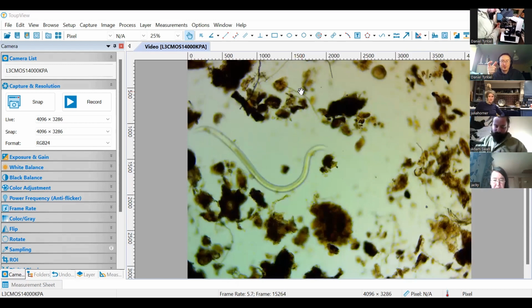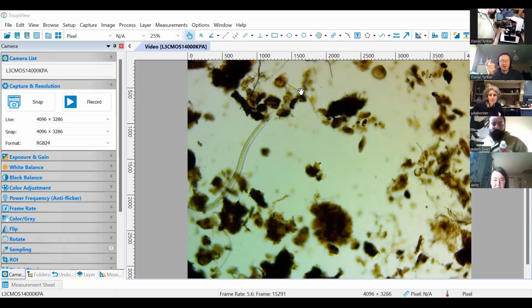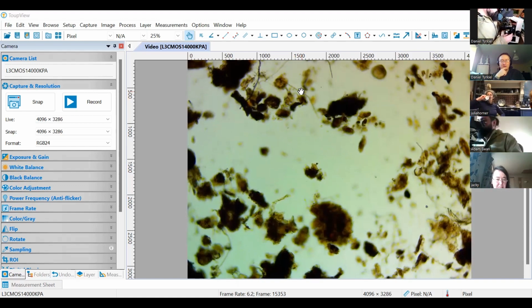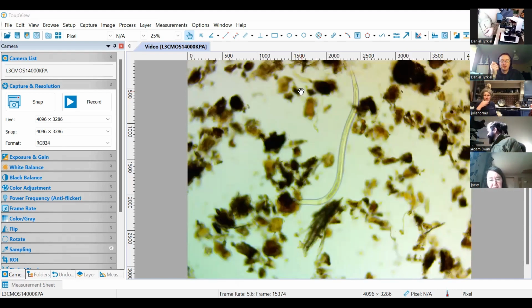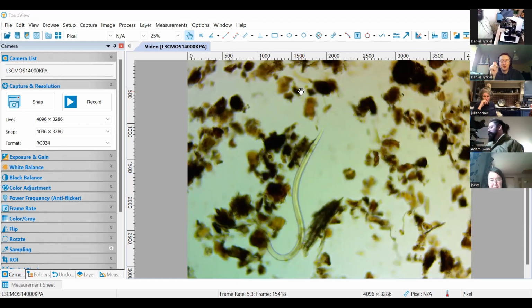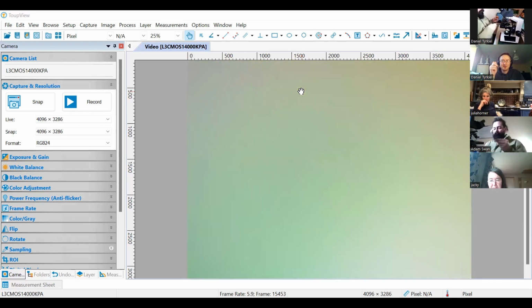Because if they're wiggling and you go down to 400 times magnification, it's difficult, because now you have to track the mouth parts with the stage, and that is quite tricky. You have to have very high dexterity and experience to be able to do that. The other way to do it is quite barbaric, and I'm terrible at it: you use a lighter, and you basically tell them with the heat that conditions are changing. I think this is what Adam is trying to show right now.